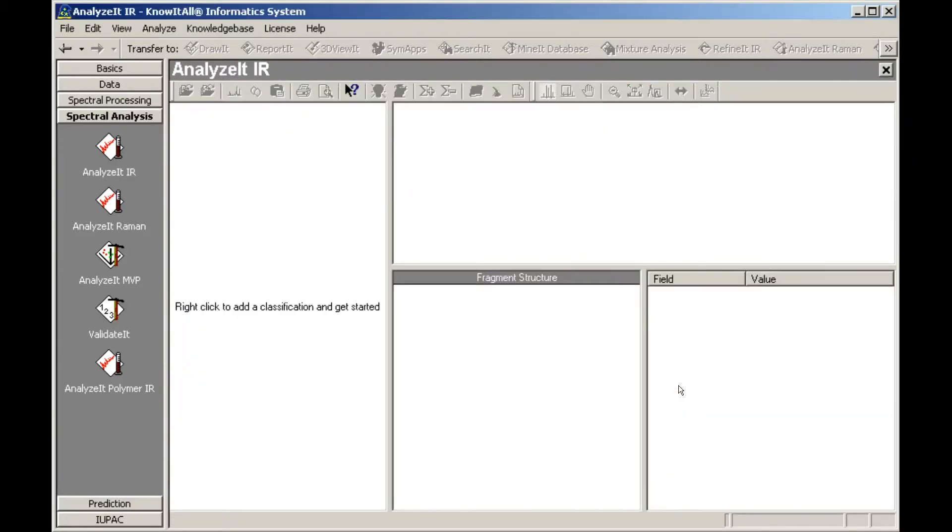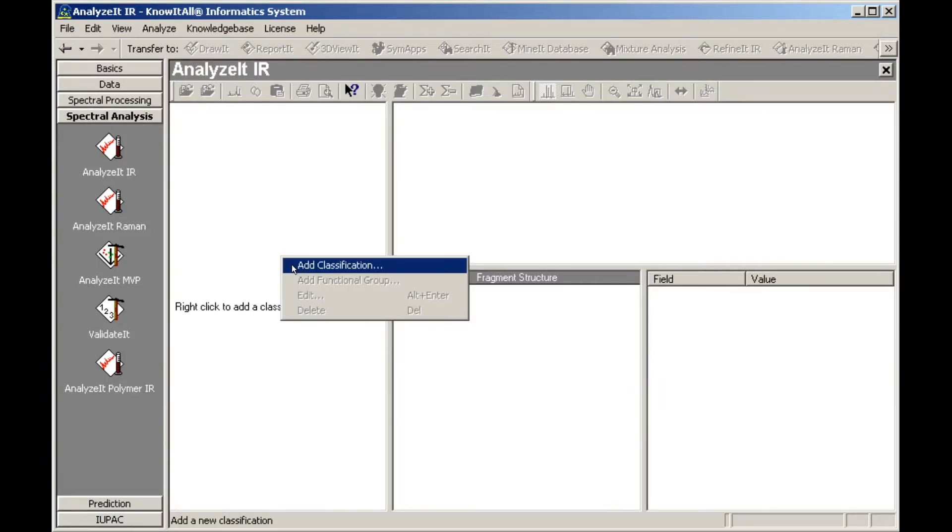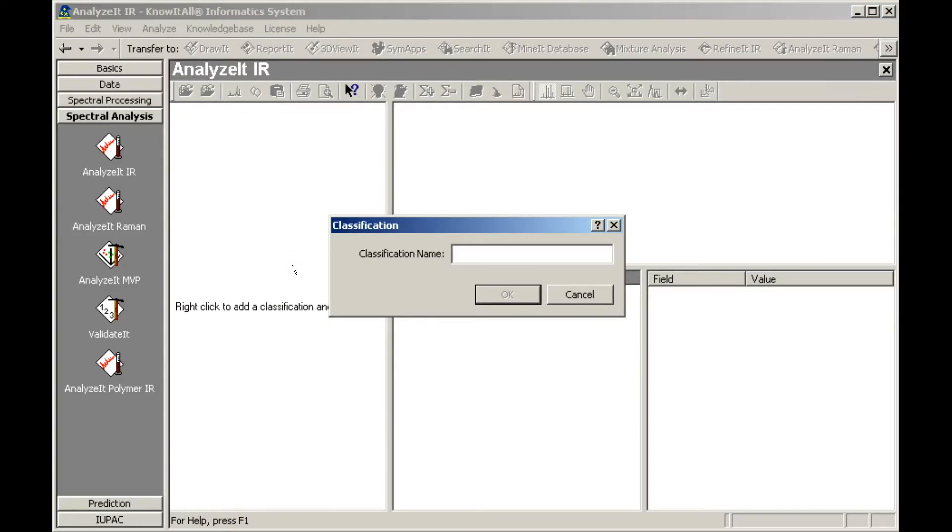The first step is adding the first classification. Right-click in the functional group tree to get started. Type in the name of the classification. To make sure the classification appears in the correct order when browsing a functional group, add a unique identifier to the end of the classification name.